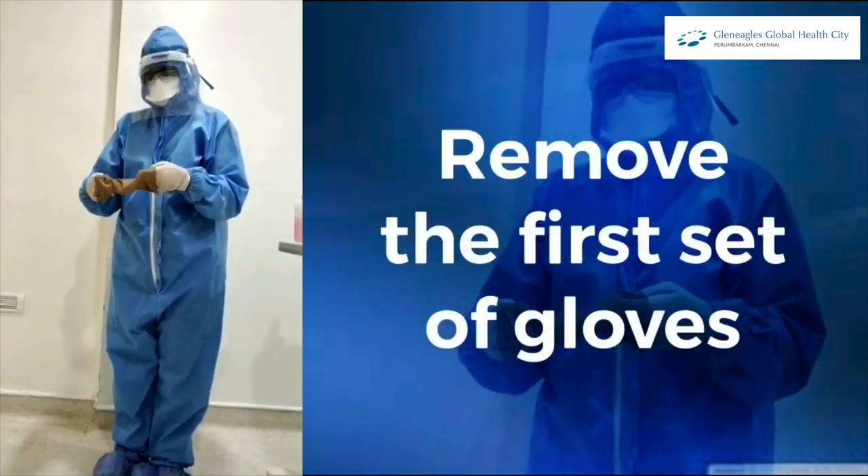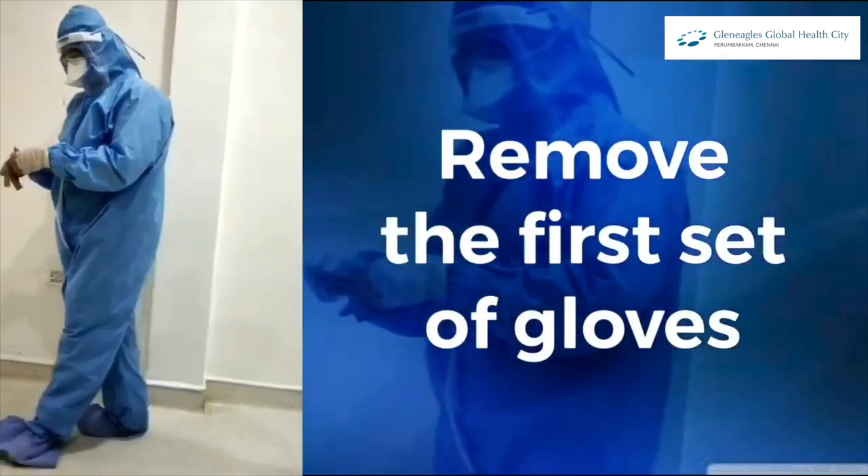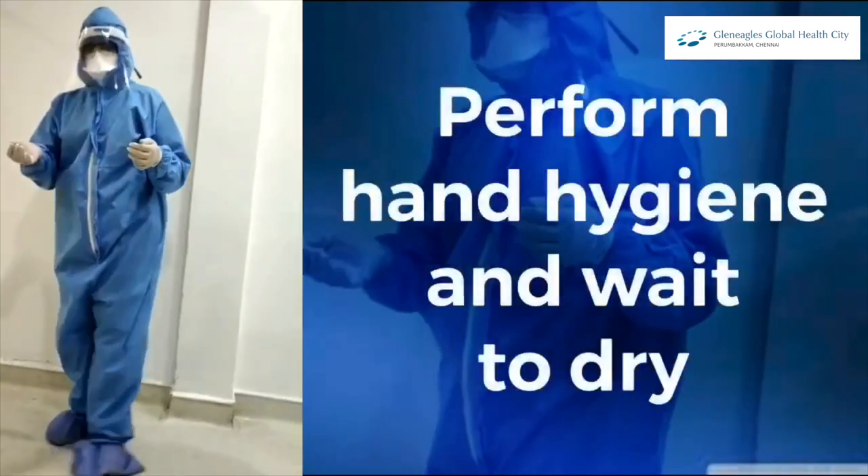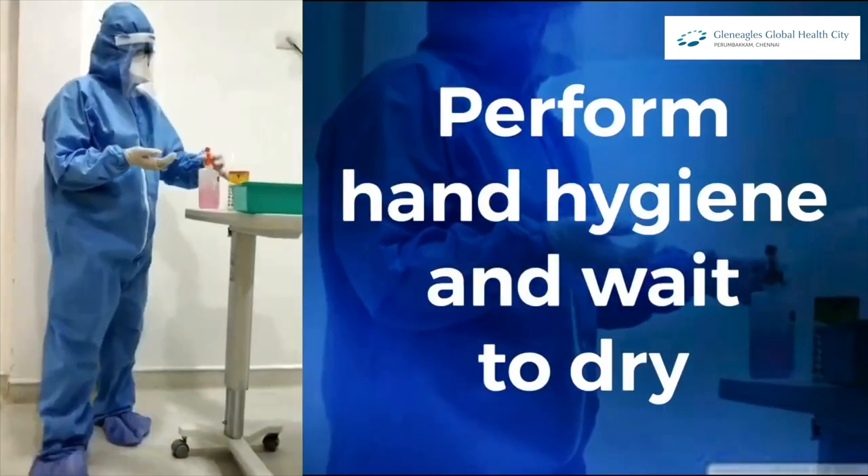First, remove your first set of gloves. Then perform hand hygiene and wait until it dries.